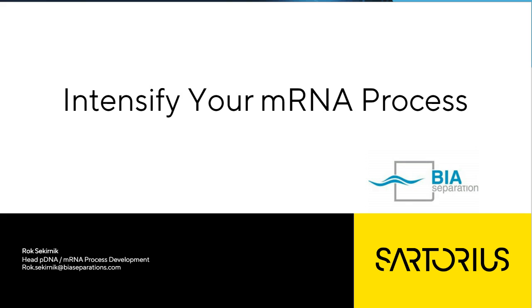Okay. Next question, we've got a couple more minutes. What is the quantity of mRNA we can purify on HPLC? This is a question that maybe I can answer from two points of view. The first one is, are we talking about HPLC as the analytical chromatography with the multimodal PrimaS method that I was showing before, which can be used also for small scale purification.